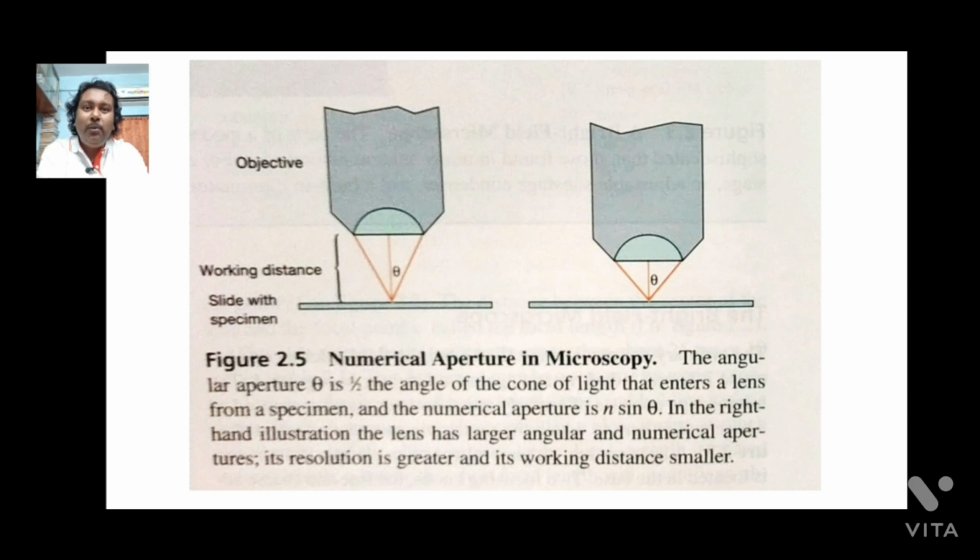This is due to the number of elements of the lens. A lens with higher magnification can be manufactured by the combination of small lenses. The lenses may be plano-concave, biconcave, biconvex, etc. By combining those small lenses, a lens of larger magnification can be created. For that reason, the 100x objective has a large number of lens elements, and 4x has a lesser number of lens elements.